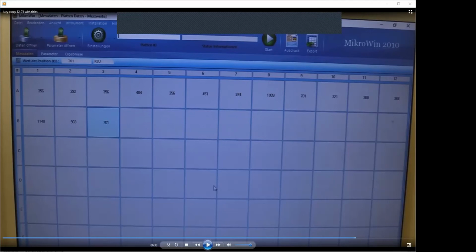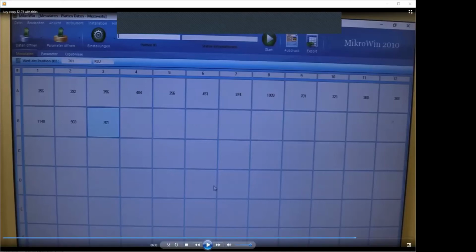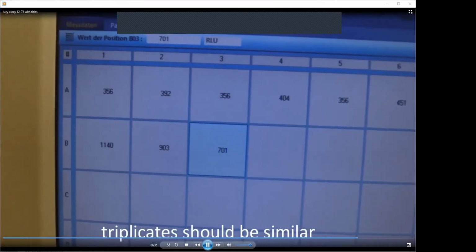To say frankly, until now, I have always used a different technique, and this is called lipofection, using Lipofectamine, a commercial product, instead of calcium phosphate, and with that it worked much, much better. In this case, I wanted to test whether it's possible to use this particular MEVs using the calcium phosphate technique. Obviously, it was not the best idea because the efficiency is very low.